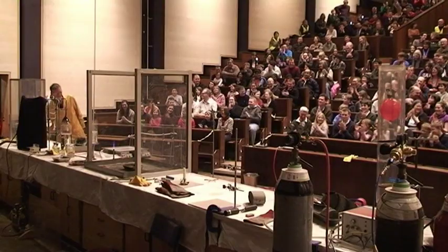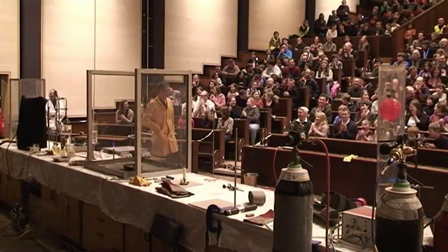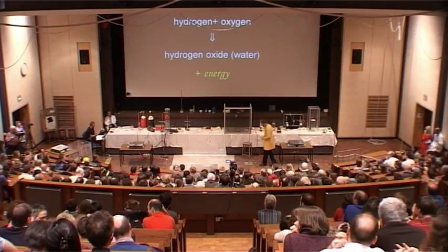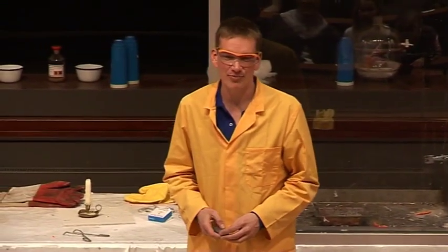Okay, so I hope you agree then that hydrogen is slightly different from the oxygen.